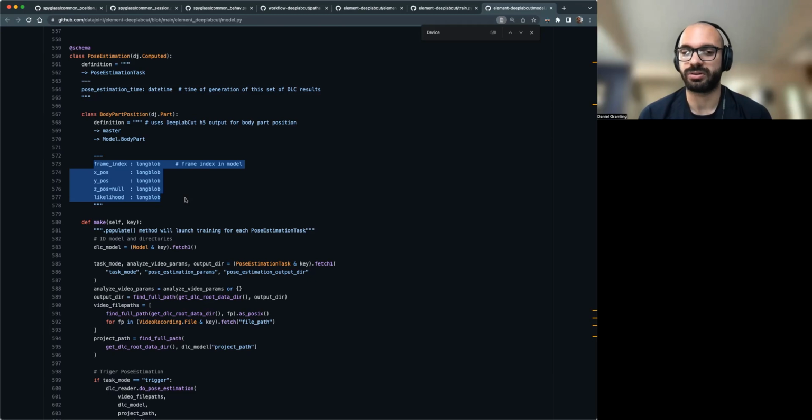Is there a reason that you're storing all of the PoseEstimation output in a part table versus a file that lives outside, like a CSV, for instance, and then just having a path that you call from for the part table? Yeah, we wanted the result to be available within the tables for end users, out of the expectation that some analysis table is going to look upstream at this, and we don't want to save to disk and then have to load from disk again.